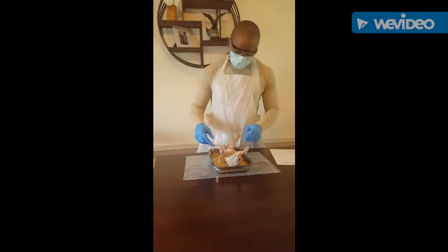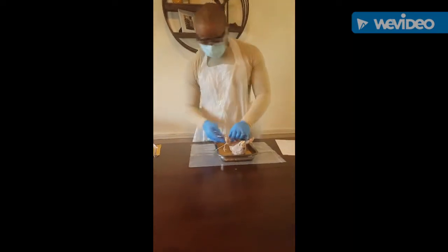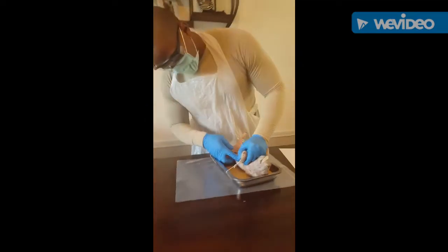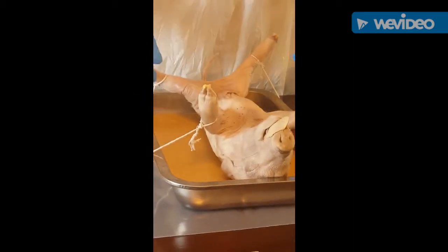Now the appendicular skeleton region is the humerus. The humerus is going to be similar to the bicep. So it's going to be this. Not this first leg here, but it's going to be the other part here connecting. So you can kind of see where that bend is. This bend here is the humerus bone.